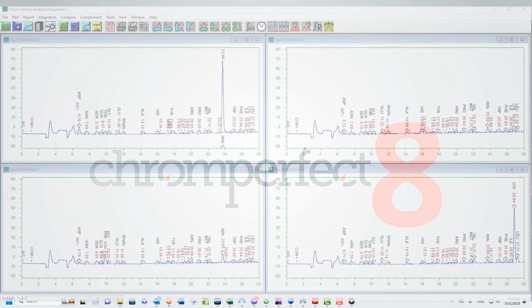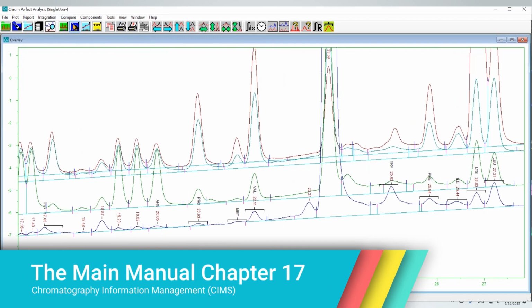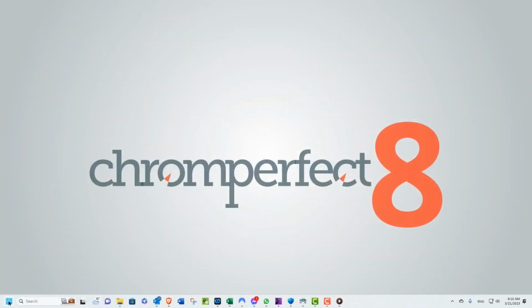Welcome to this Chromperfect training video. This video was produced using Chromperfect version 8 and Windows 11. Other versions of the software and operating system may be slightly different. Check your manual for information about your version of Chromperfect.